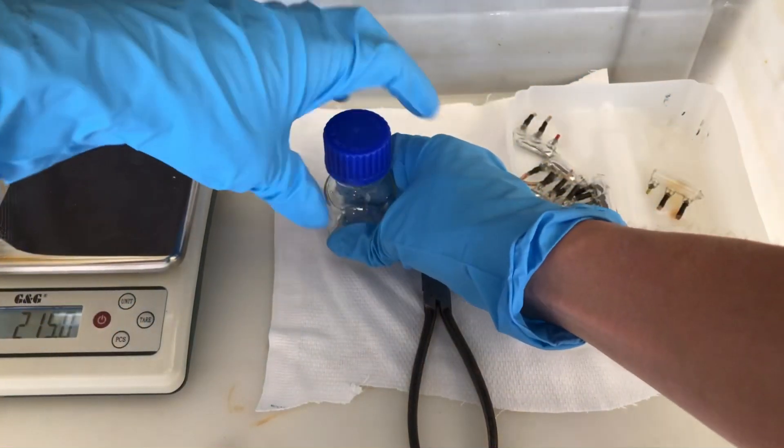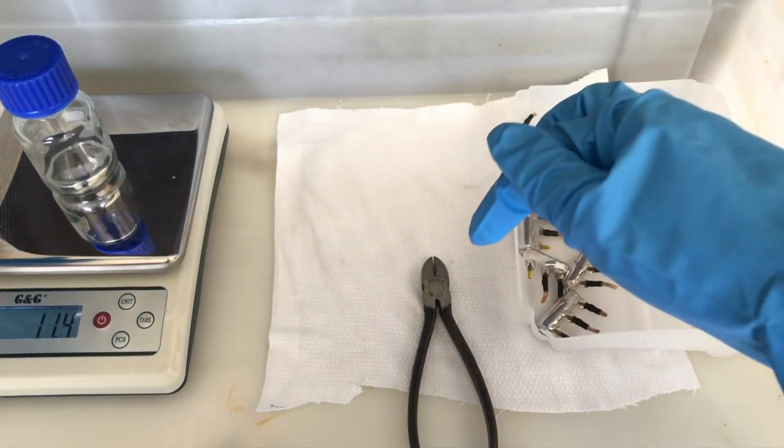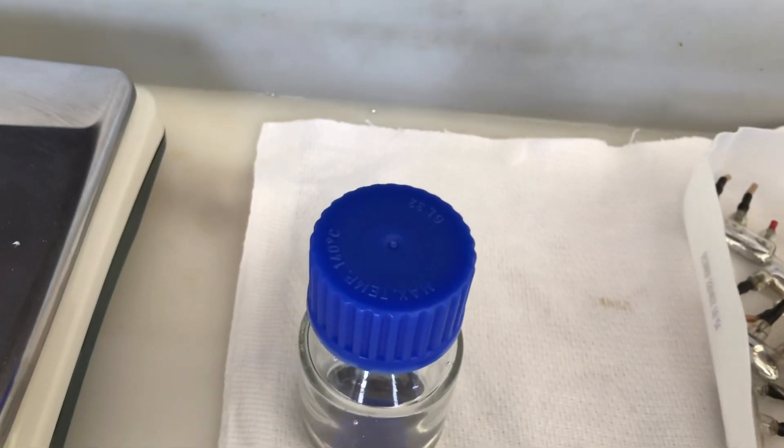The bottle was capped and we weighed it again. It turns out that this one switch contained 11.4 grams of mercury. And here's why you should use a plastic container while dealing with mercury.